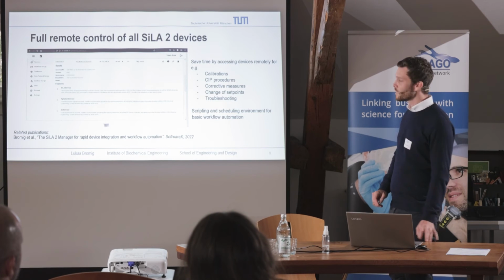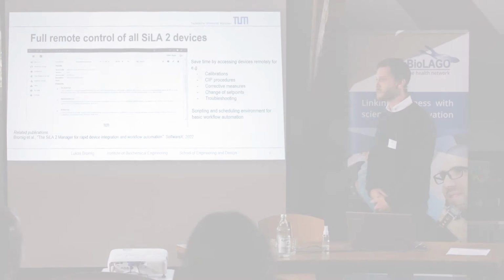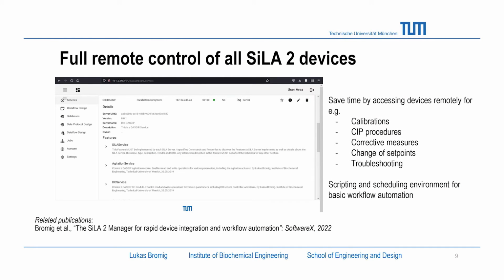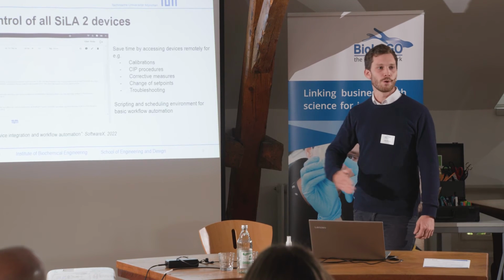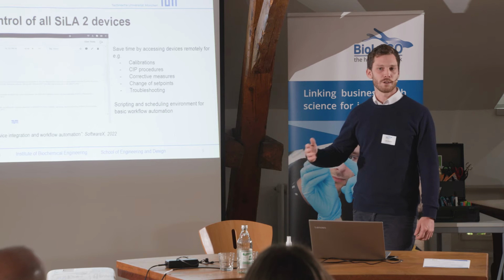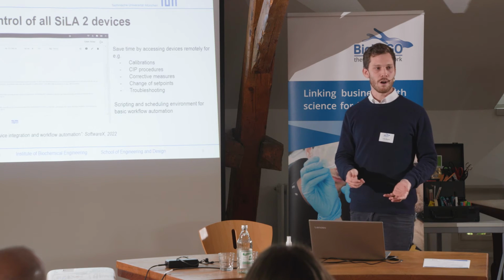Yeah, so a further advantage that we now have is we can access our devices from a single source. So I wrote basically a laboratory management system called the SiLA Manager, from where we can remote control all our SiLA-enabled devices from wherever we are, which is pretty handy, since most of our experiments run over an extended period of time, over the weekend, overnight. And the longer these experiments run, the less you want something to go wrong.